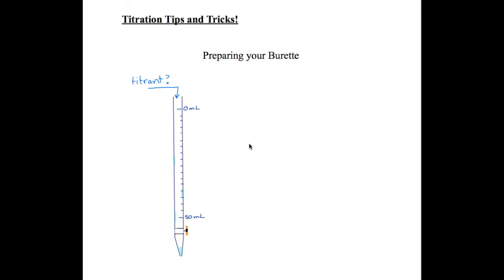Now that we've learned what titrations are, and we've learned about standardized solutions, and we've learned a little bit about the calculations involving titrations, let's get down to the nitty-gritty of the technique. Titration does take a little bit of practice to get used to, and there are some techniques that can help us have a more successful titration. I'm going to go through just a few of them. Unfortunately, you're going to have to learn a few of these by trial and error.